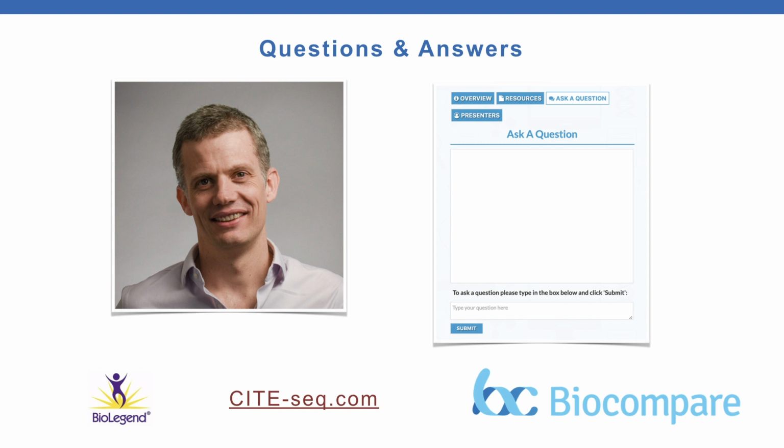So yeah, I think long story short, any method that's going to use poly-T capture beads or any other type of poly-T capture, CITE-seq can easily be made compatible with.